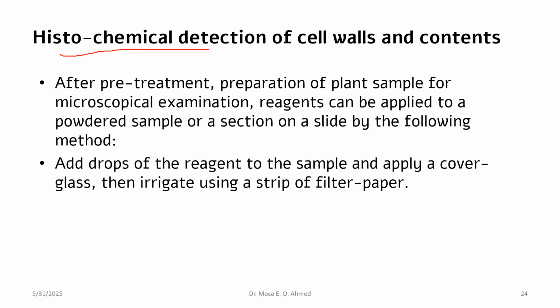Also, histochemical examination is applicable for a cut sample, dissection or resection, for powdered material, or for organized material. It is carried out by applying a drop of the reagent on the sample. Then we add a cover glass and examine under the microscope.